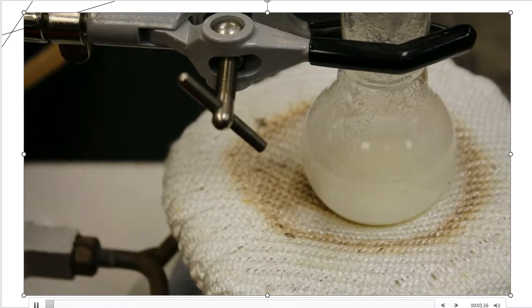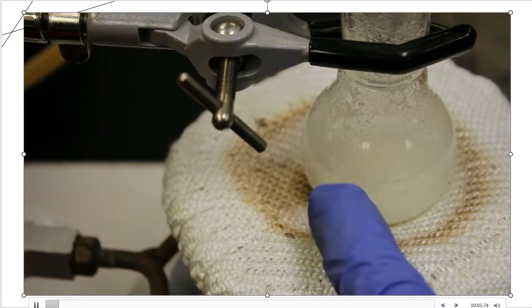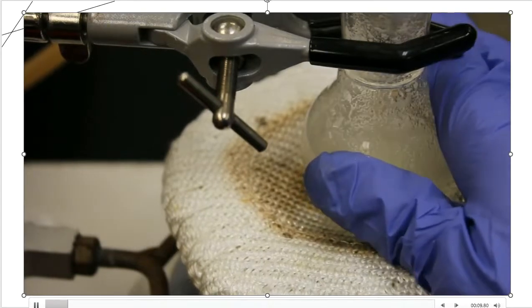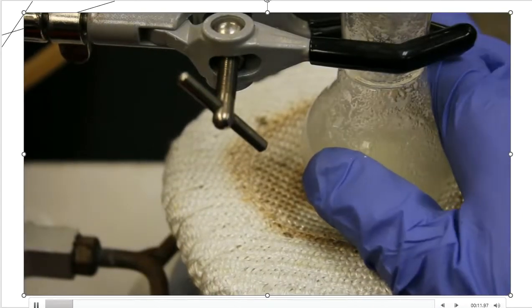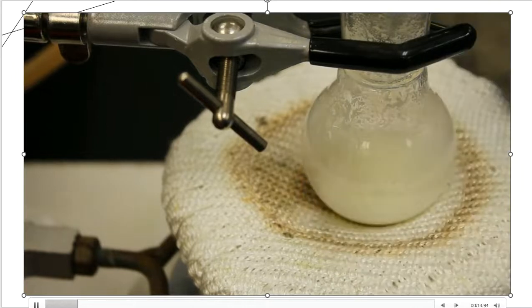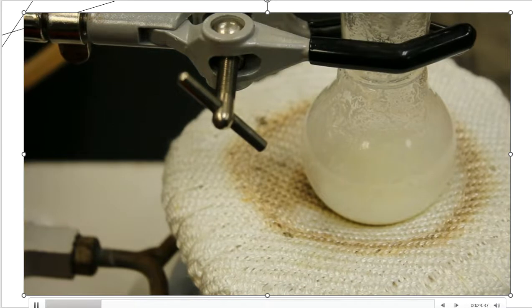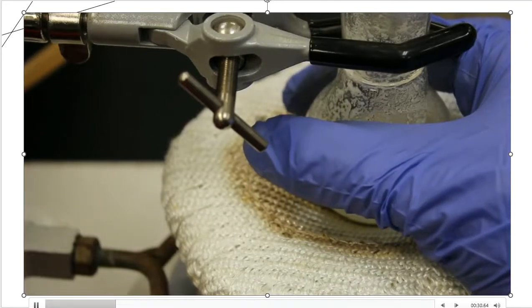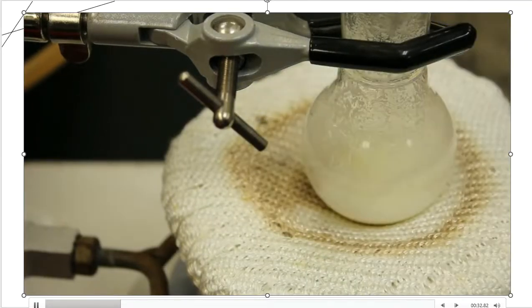All right, so here's the last leg of the Anisole lab, and you can look at this boiling flask again, very warm, but it's not super hot where I can't touch it with my hand. This is just the nature of the low boiling point methylene chloride, and it doesn't take a lot of heat to get these reagents to react together. So not a big issue at all. It's just kind of weird when you see me putting my hand on something that's boiling like spaghetti water on the inside.